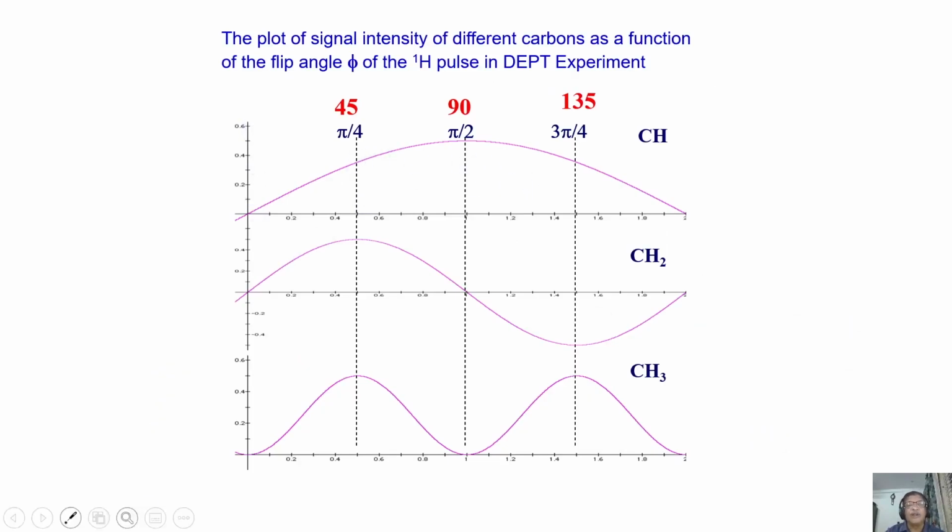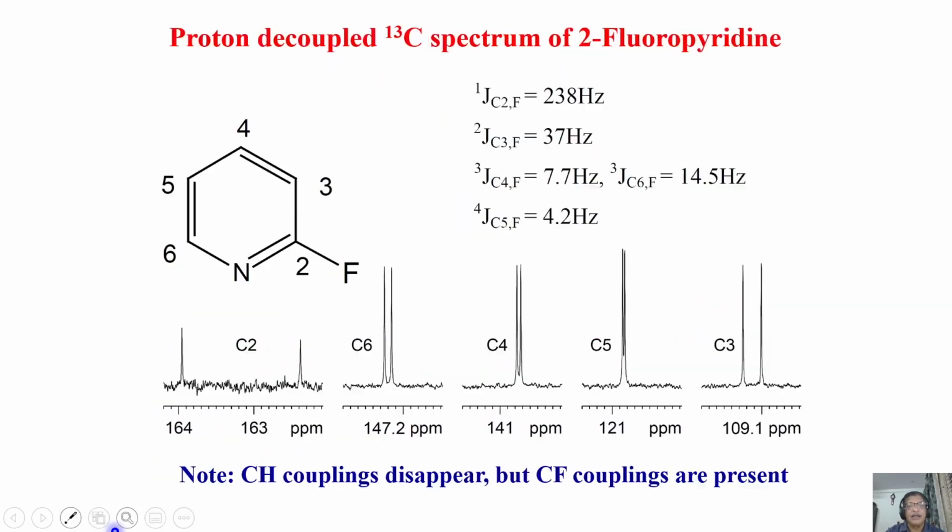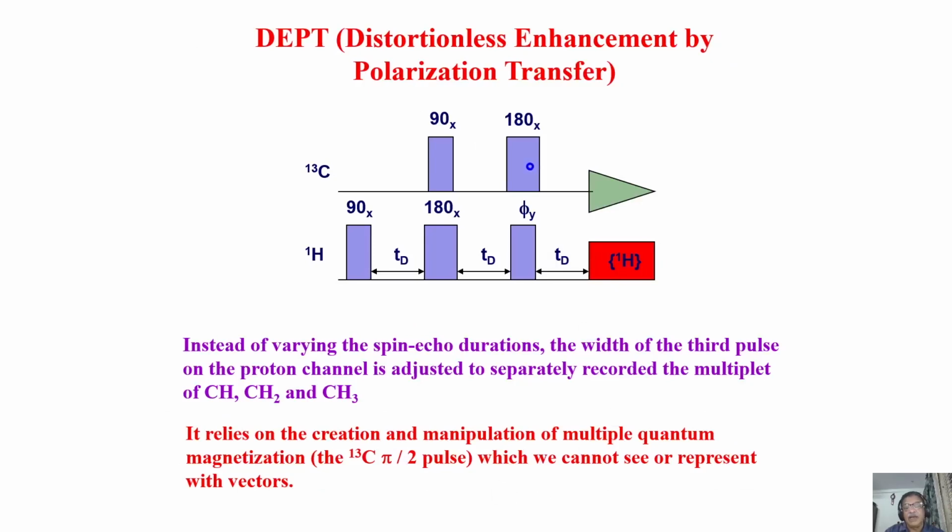Now what we can do is plot the intensity of different peaks, different carbons, as I vary this angle, starting from 1 degree to 5 degree, 10 degree, in steps of 5 or 10 degree, and keep on varying. I have a molecule which contains CH3 carbon, CH2 carbon and CH carbon, all the 3. That's what, let us say, I assume I have.